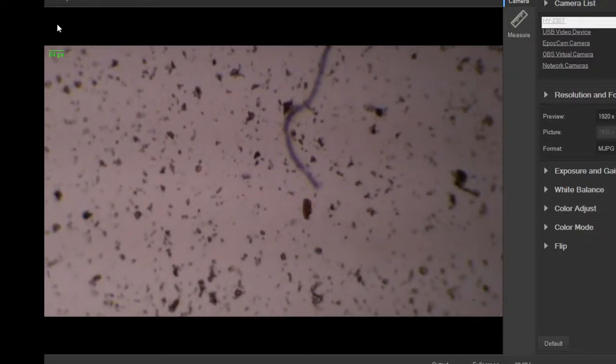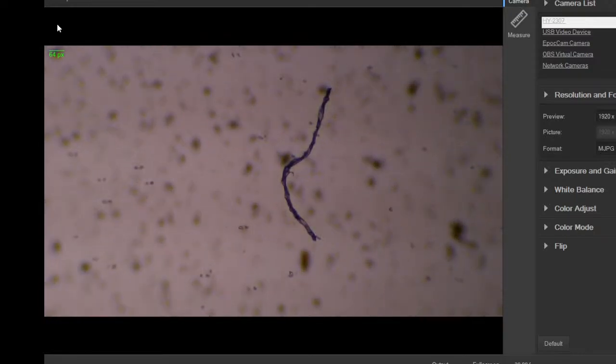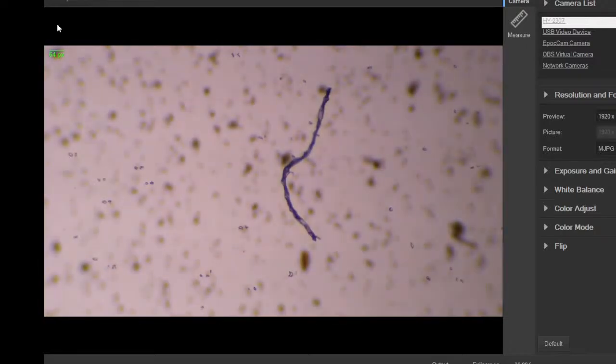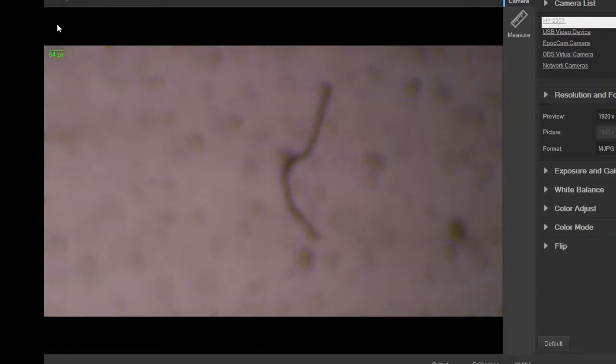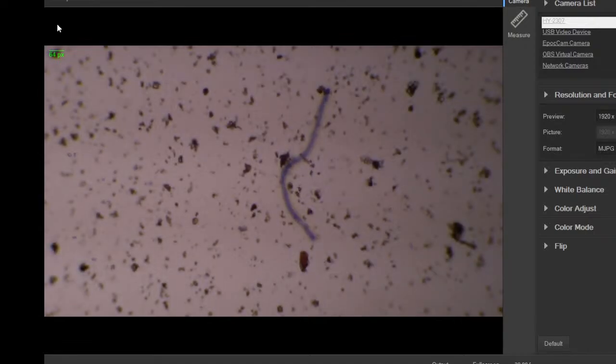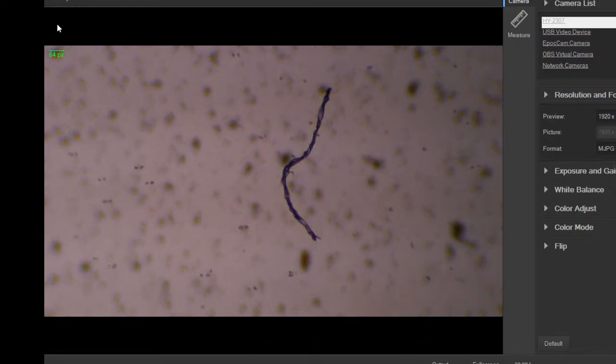There's an industrial fiber there. It's kind of bluish color. It's definitely not natural. Hope this light picks it up here. It's still kind of dark. If I defocus it, you should be able to see it's kind of blue. A bluish color. Some man-made fiber there.